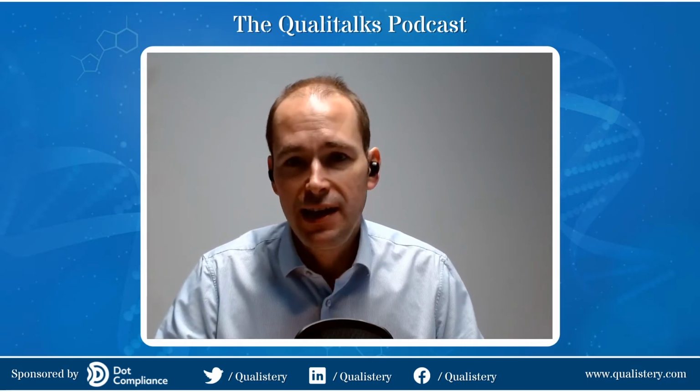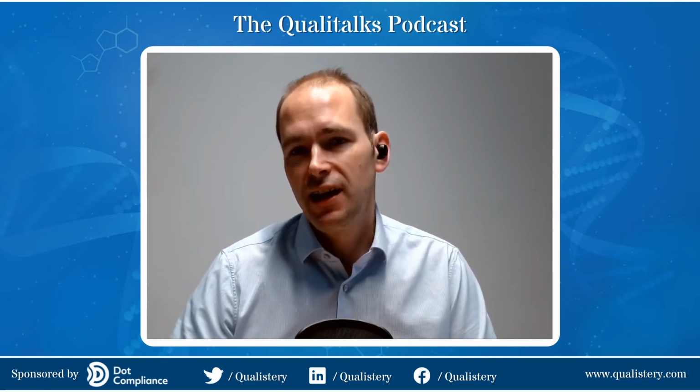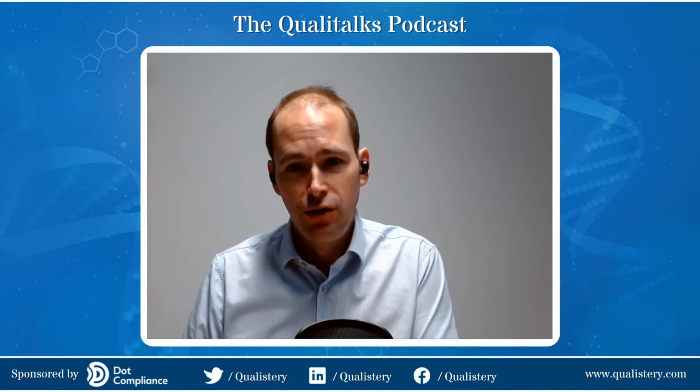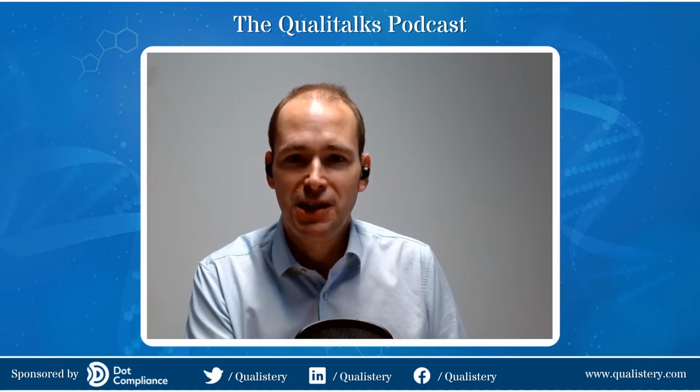Absolutely, yeah. So most of the big manufacturers will be able to specify your autoclave for your application, and that would be whether you're meeting a standard like EN 285, a European standard which focuses on air removal. Some of those aspects would include air detectors, which are used predominantly in the UK and Ireland, but you would need to specify that again in your URS. So that's a basic example of something that you would need from a local perspective. But on the broader scale, there will be issues potentially with wet loads, with air removal, that can be rectified if you do that before you purchase the machine. And again, that's working with your suppliers to ensure that you get that.